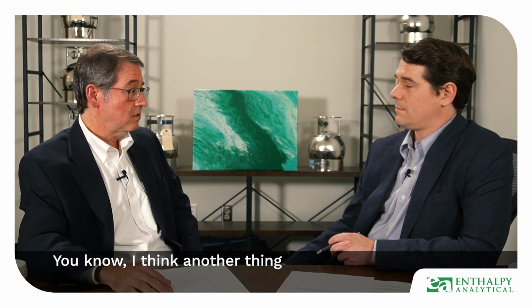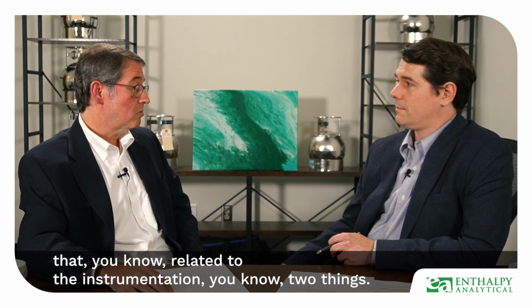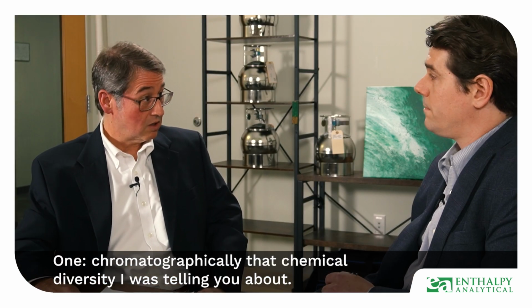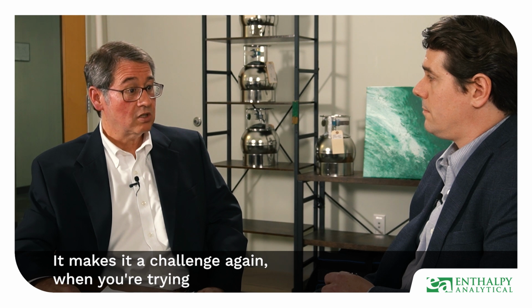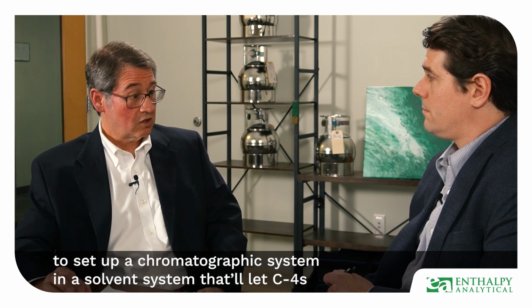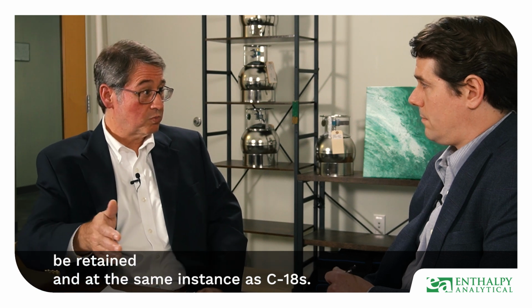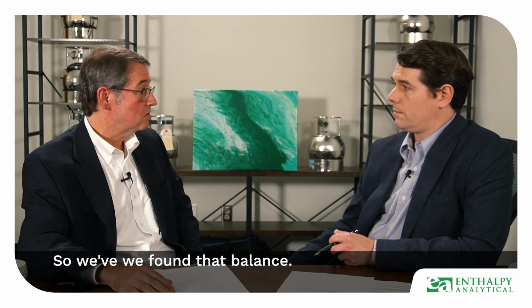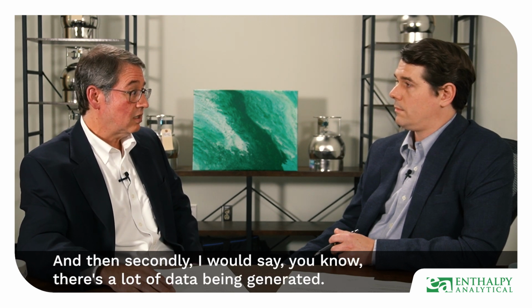I think another thing related to the instrumentation, two things. One, chromatographically, that chemical diversity I was telling you about makes it a challenge when you're trying to set up a chromatographic system and a solvent system that'll let C4s be retained in the same instance as C18s. So we've found that balance. So that's one key. And then secondly, I would say, there's a lot of data being generated.